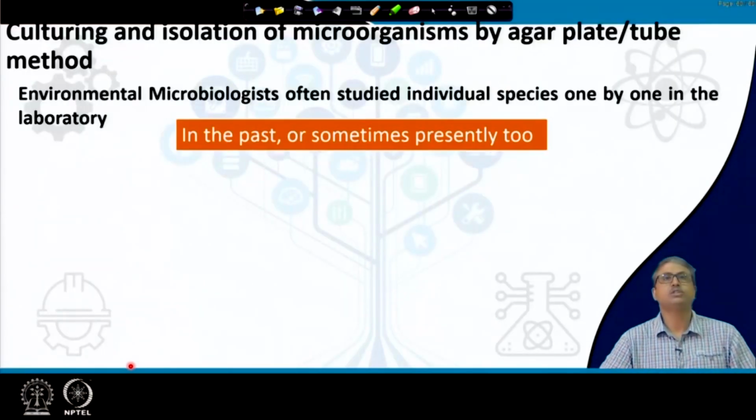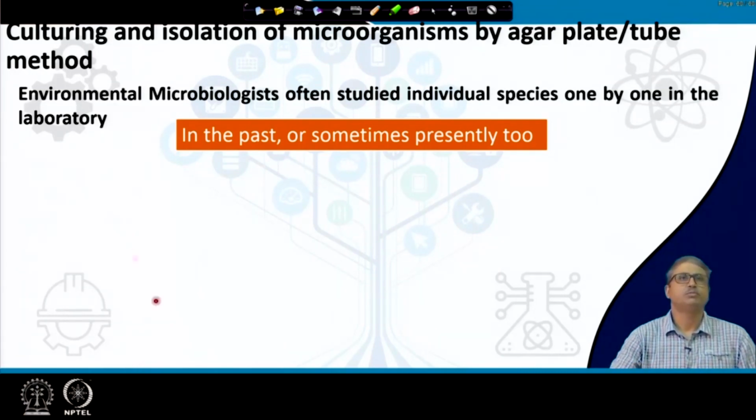Culturing and isolation of microorganisms by agar plate or tube method have been a very important step for environmental microbiologists, as it is for general microbiologists as well. Environmental microbiologists or biotechnologists often study individual microbial species, bacteria and archaea, from different types of environments one by one.